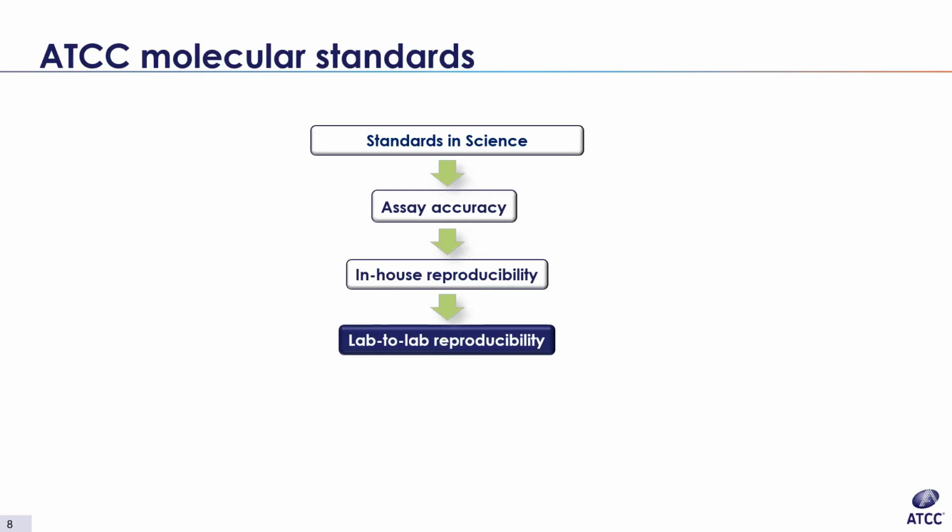I've been on both sides of a failed assay handoff where my design didn't work in another lab, or where I tried an assay that was given to me or that I found in literature and it didn't work in my hands. But probably more commonly, the assay works, but not quite the same, and some more optimization is needed. And in that case, you want to catch the differences as quickly as possible, because if they're not caught, performance discrepancies become a frustrating drain on time, money, and morale.